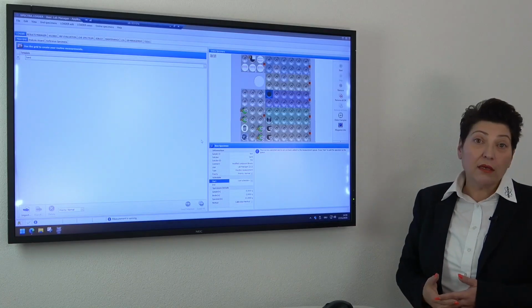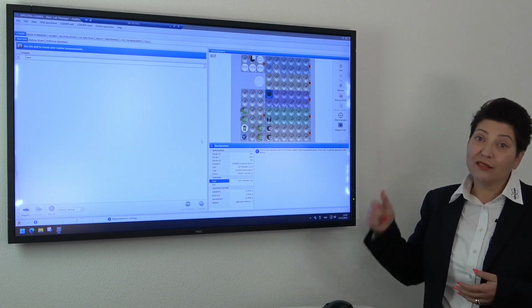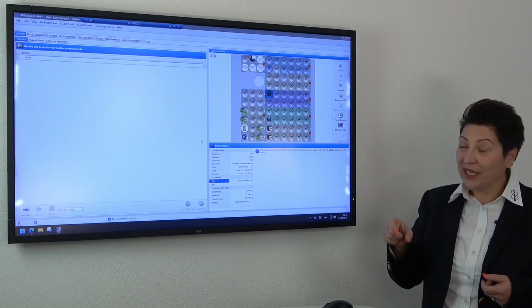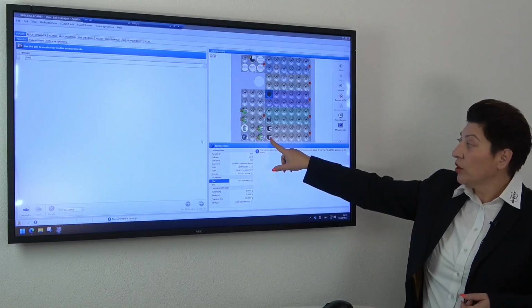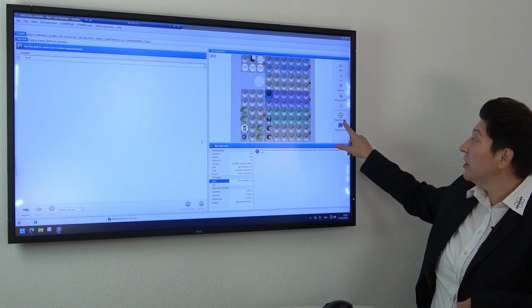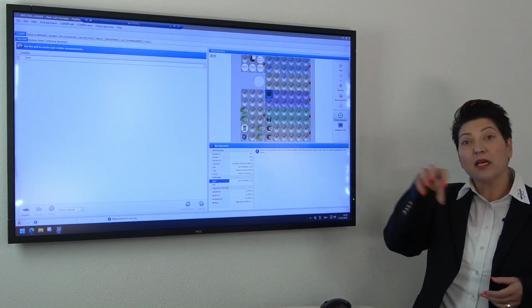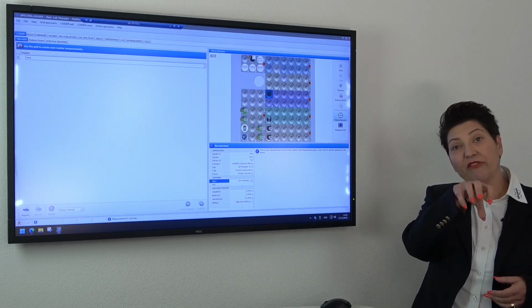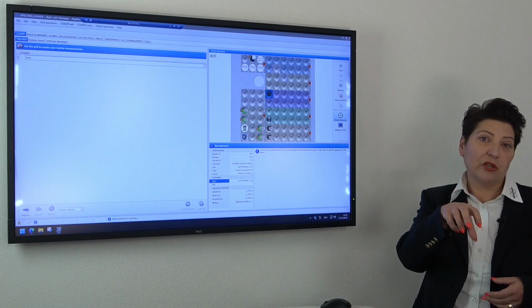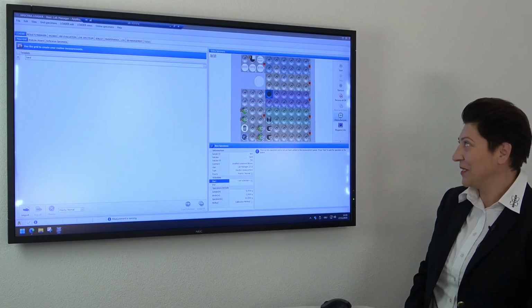I work quite frequently remotely. So if I want to make sure that the sample is still in the position where I have it loaded, not that anybody by mistake has picked out the sample, for example, if I want to check if this sample position is still occupied by my sample, you can easily use the AI camera with this detect samples button, and then the camera will make a picture of the sample position which I have selected, and then you can be sure if the sample is still loaded or not. So this is a quite nice function if you're not exactly right next to the instrument.